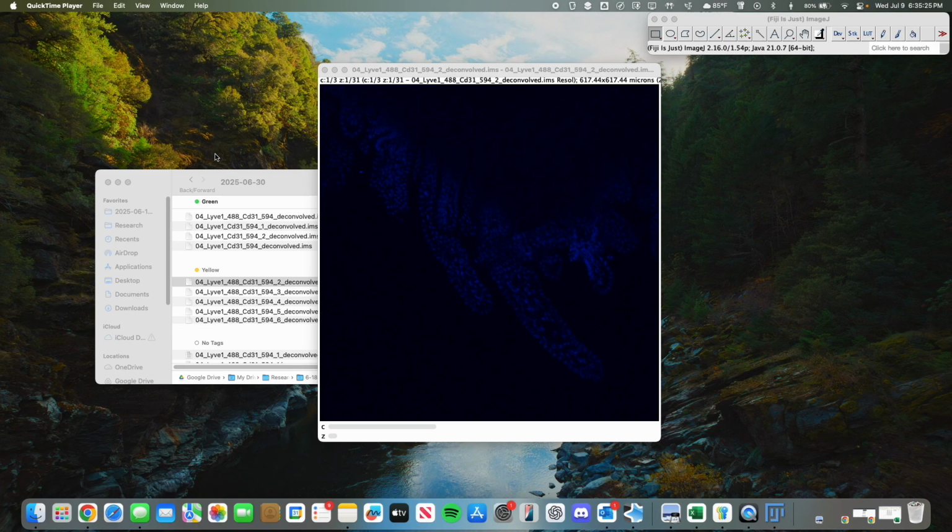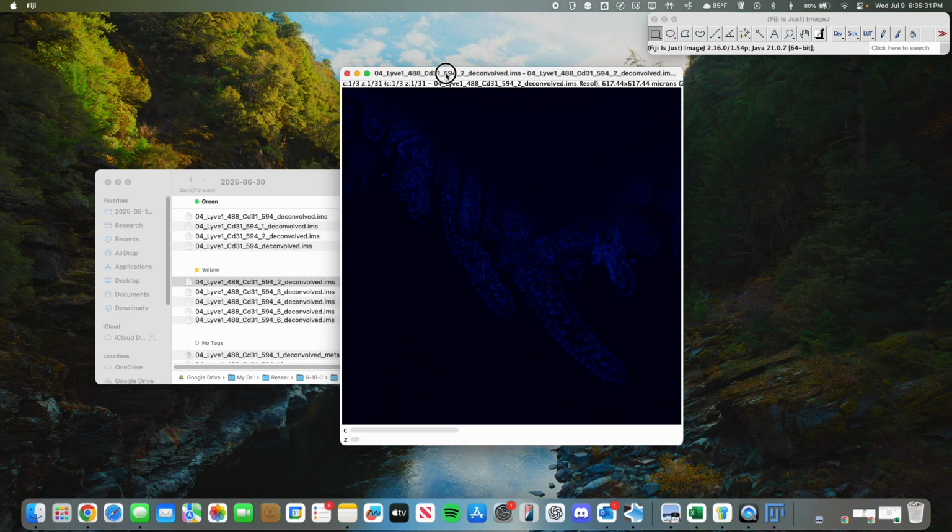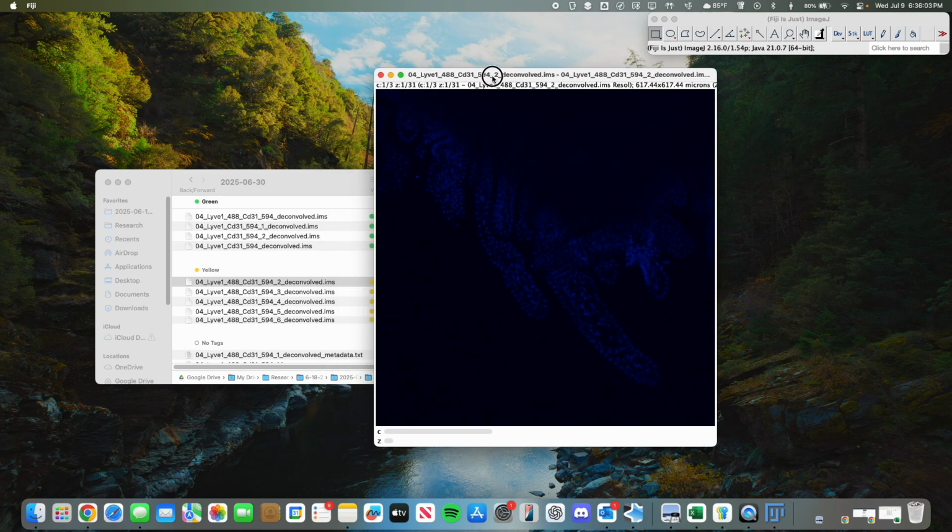In the second part of this tutorial, we're going to look over how to quantify lacteals. And when I say quantify lacteals, I mean we're going to measure these lacteals in relation to the total length of the villus, or in plural, villi. And just for some context, the villi are the hair-like projections that protrude out from the layer outside. And inside we have the lacteals, which we'll see in a second, which attach to those lymphatics in the middle of the system.